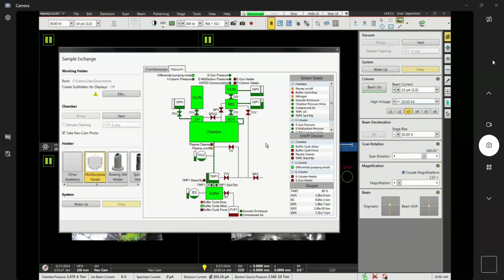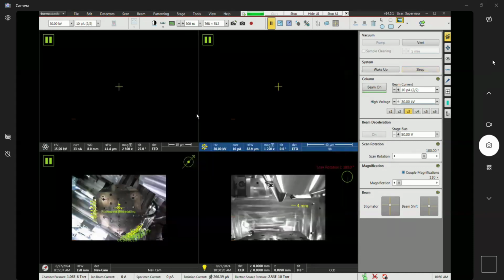No? Interesting. Okay, there we go. So yes, you can see that it actually, oops, sorry, let me turn this back up.